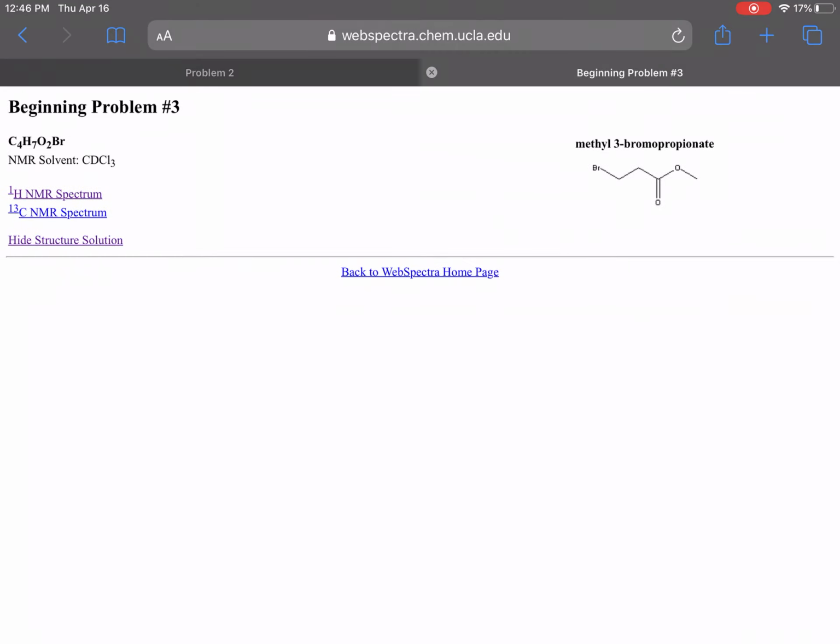So that's really all there is to it. It can be a little bit more difficult sometimes, especially if you don't have integration units and the lines bleed into each other. But what you have to do is get adept at distinguishing where you have these little funny bumps and figuring out where one ends and one begins. That being said, you will definitely more often than not be given integration units of some form.